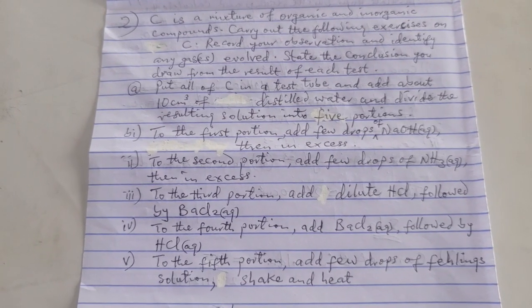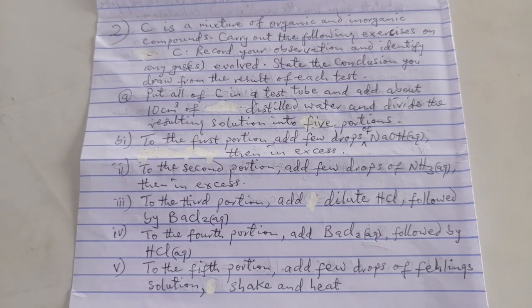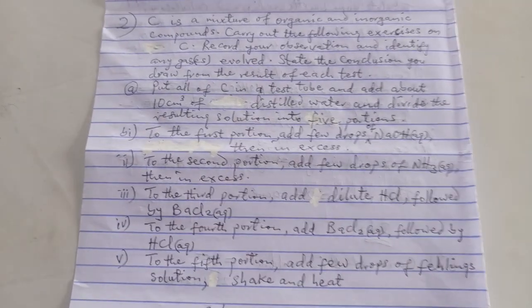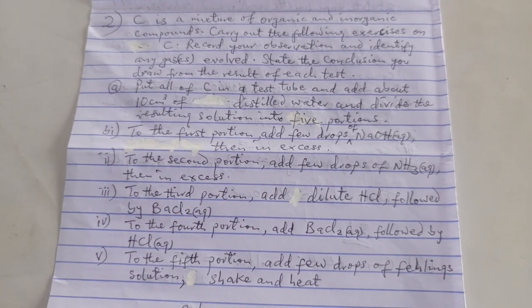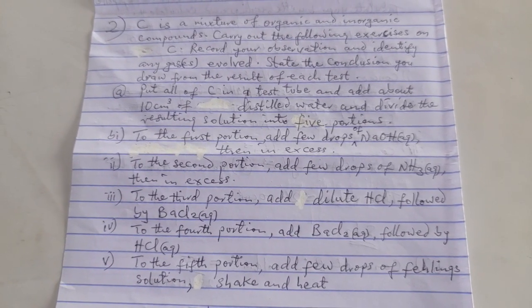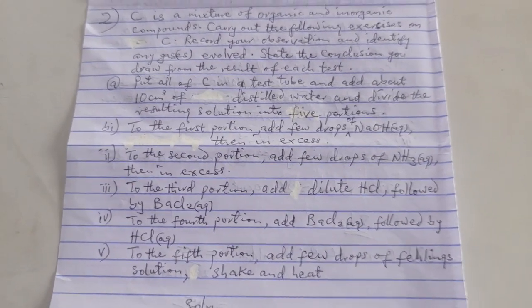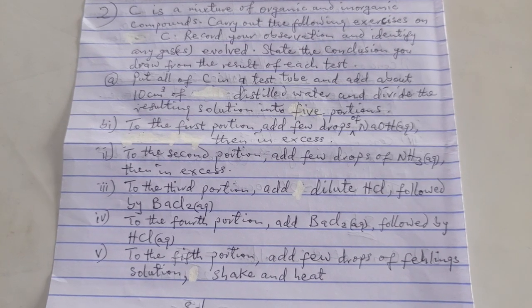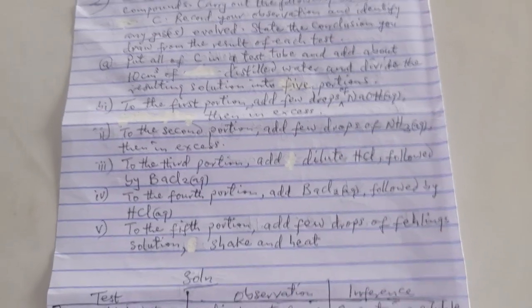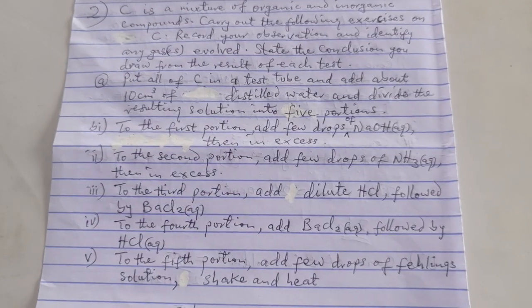chemistry practical question 2. Okay, so in solving this problem, what you need to know is about the reagents. They have told you that C is mixed with 2 substances. One is organic, one is inorganic. Now, for all the tests they ask you to carry out, you need to know which reagent you can use to test which ion.